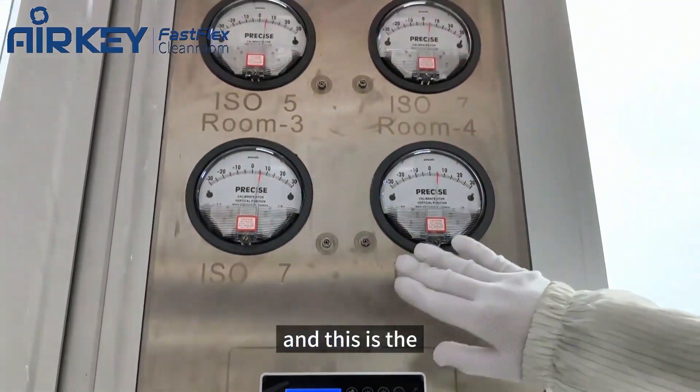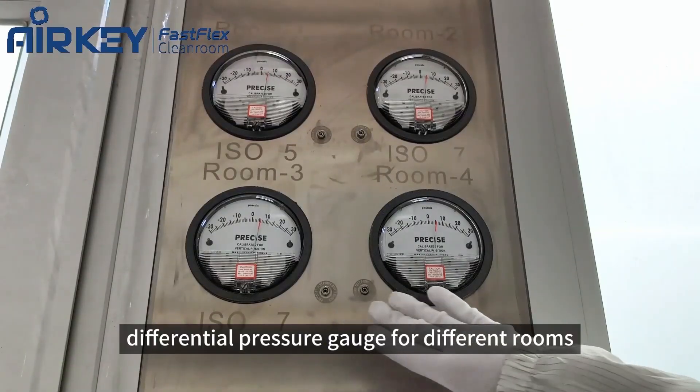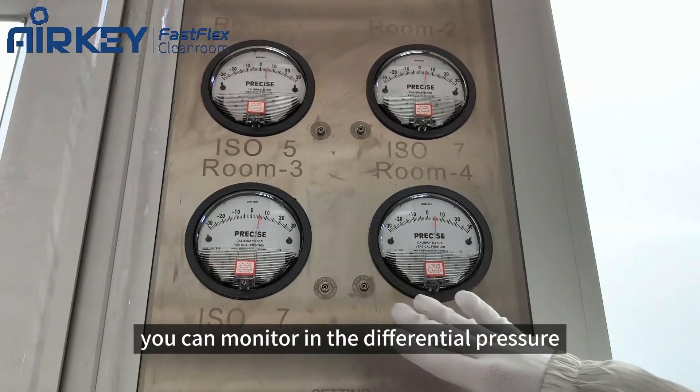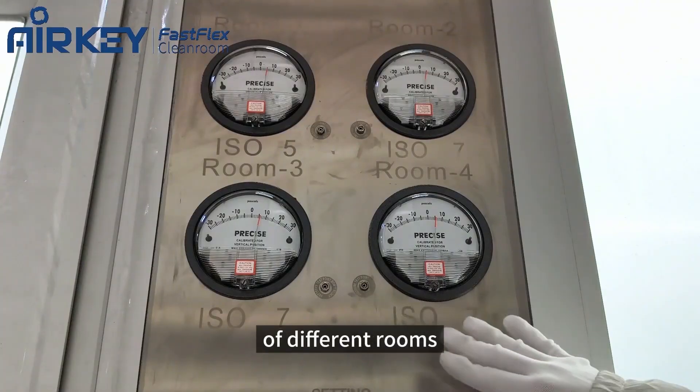And this is the differential pressure gauge for different rooms. You can monitor the differential pressure of different rooms.